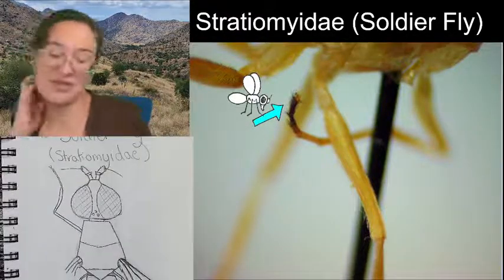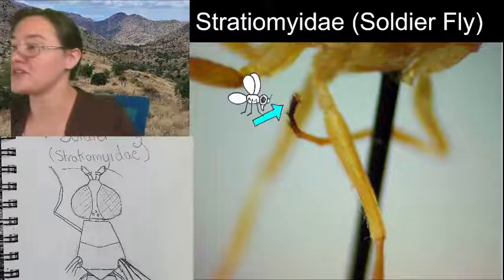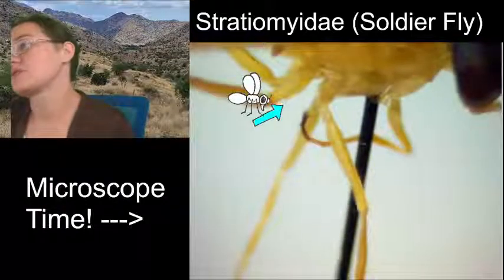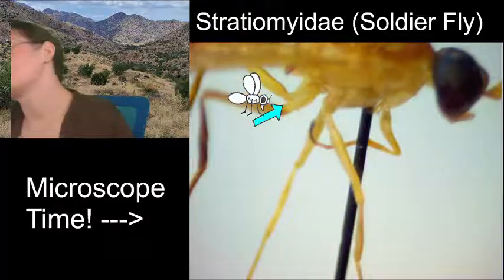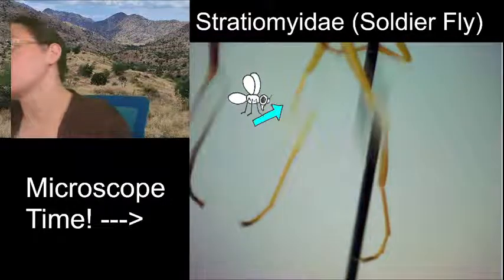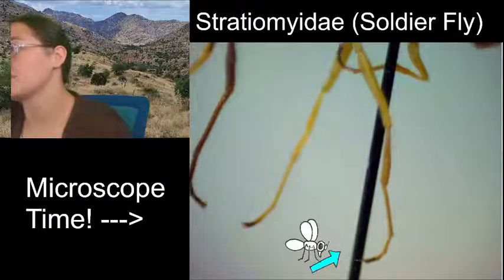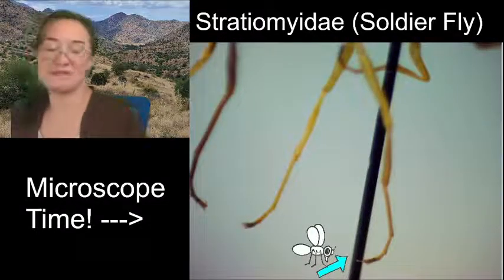All right, so we have one leg taken care of, and all of the other legs are going to be very similar. Long and thin with 4 tarsal segments.